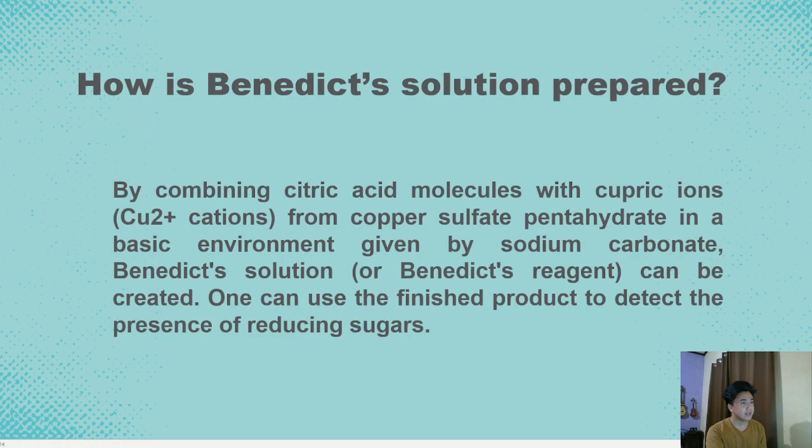So, how is Benedict's solution prepared? By combining citric acid and molecules with cupric ions from copper sulfate pentahydrate in a basic environment given by sodium carbonate, Benedict's solution or Benedict's reagent can be created. One can use the finished product to detect the presence of reducing sugars.